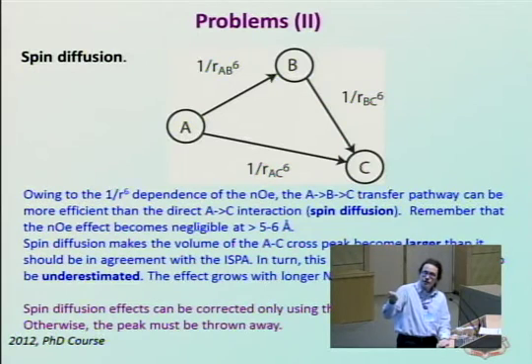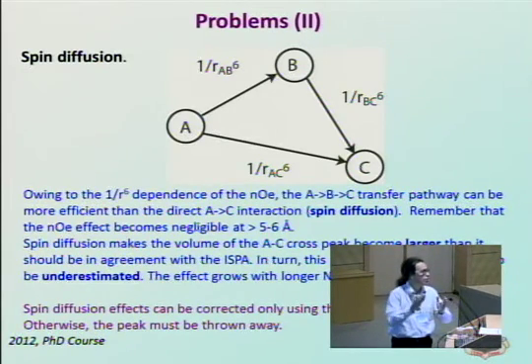And this interaction is actually making the intensity of the signal involving A and C higher than it should be in the 2-spin pair approximation. So if B were not there, A and C would have a given intensity, but because now B is there and you have an additional contribution, you get a larger intensity of the signal, which means that because the intensity is higher, the system will try to push the atoms closer.